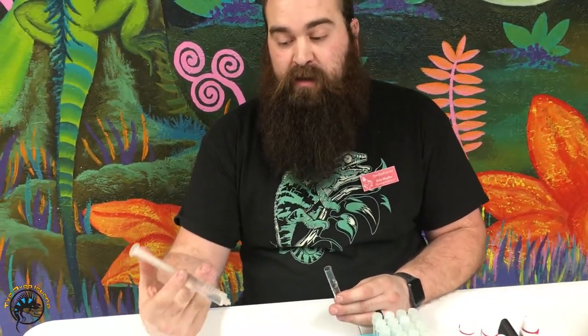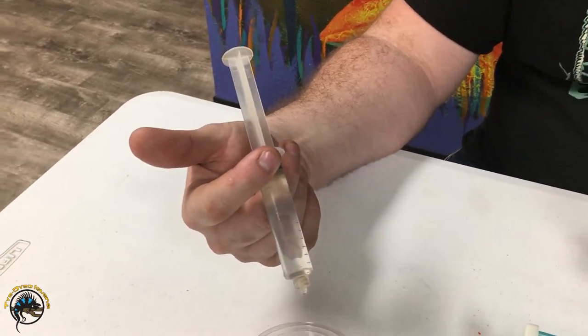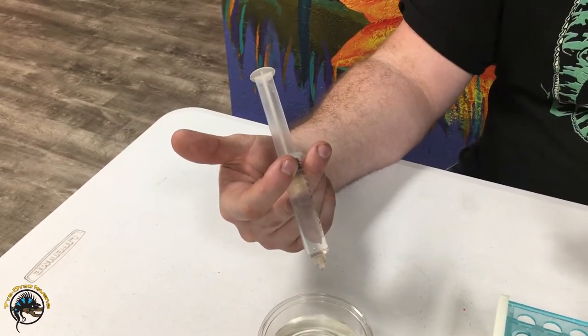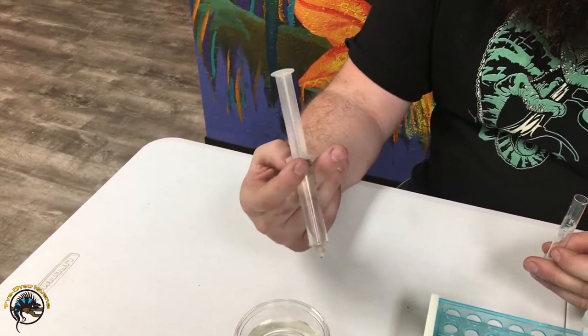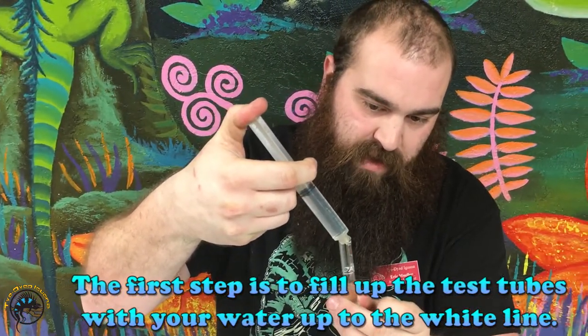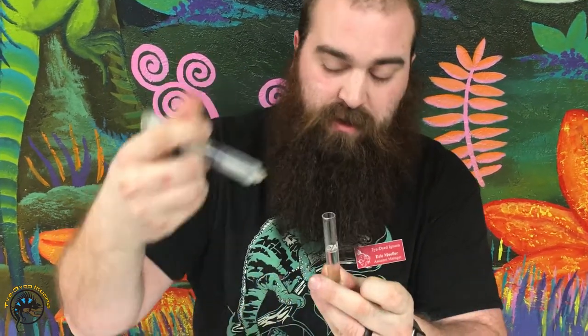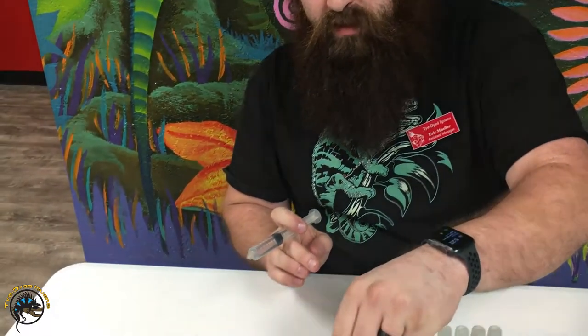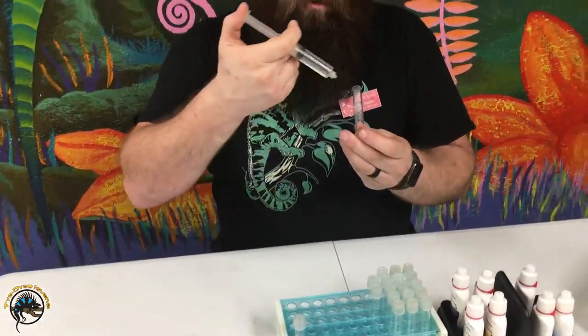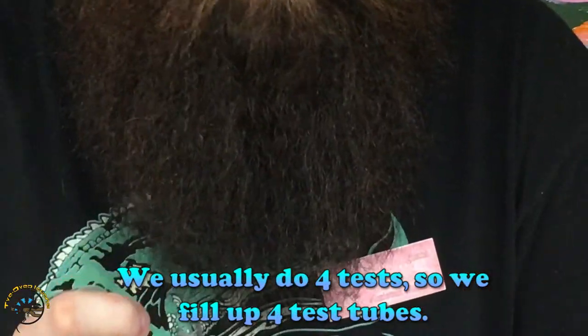We use a little syringe — this is actually some water a customer just brought in that needed to be tested. We're going to use the API test kit. You fill it up to the line pre-marked on there, which is five milliliters. I'm going to pre-fill four of them.